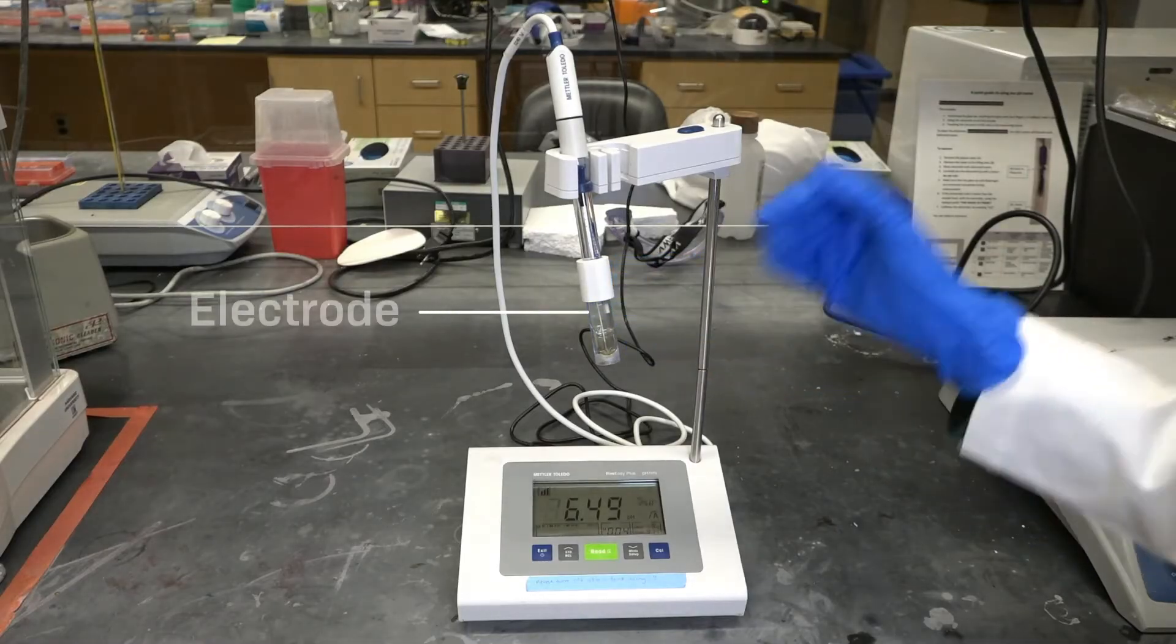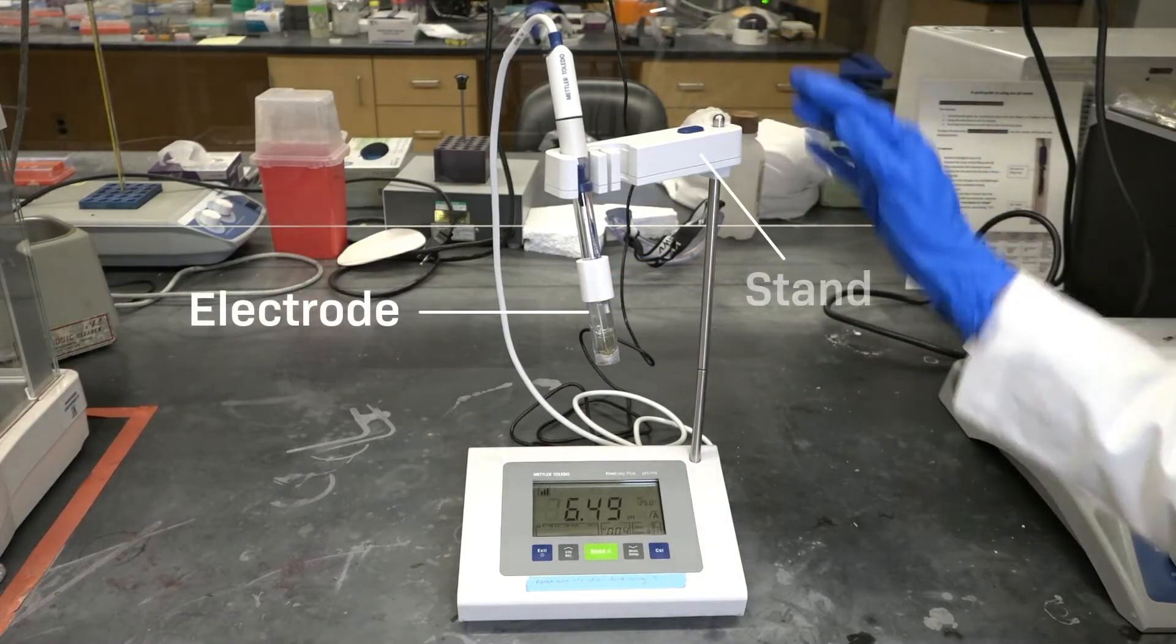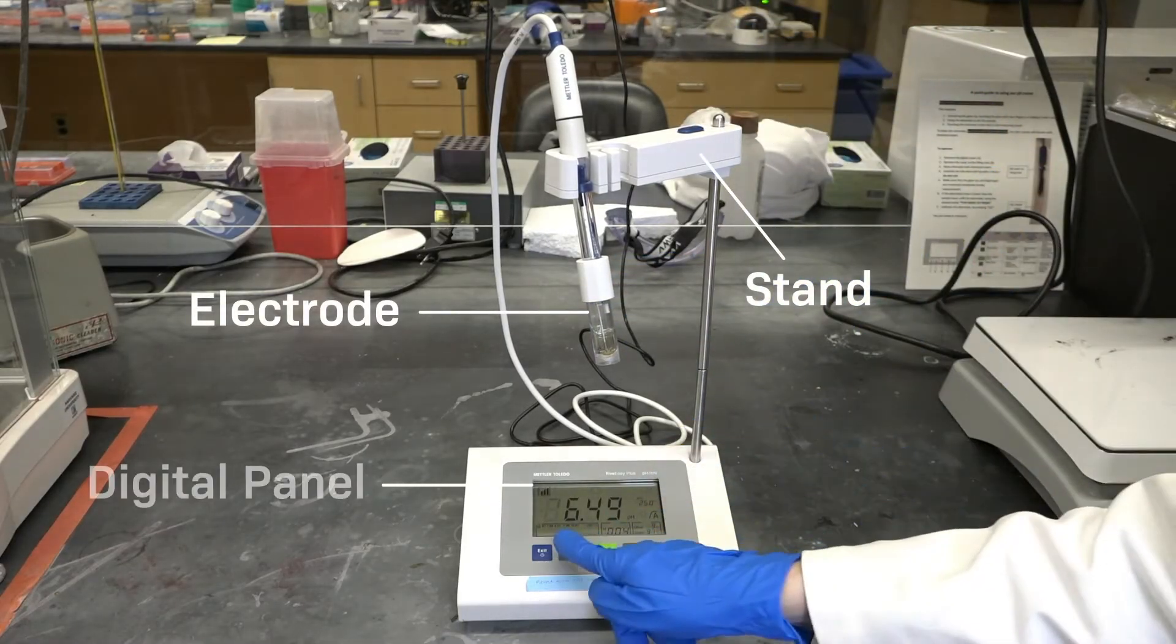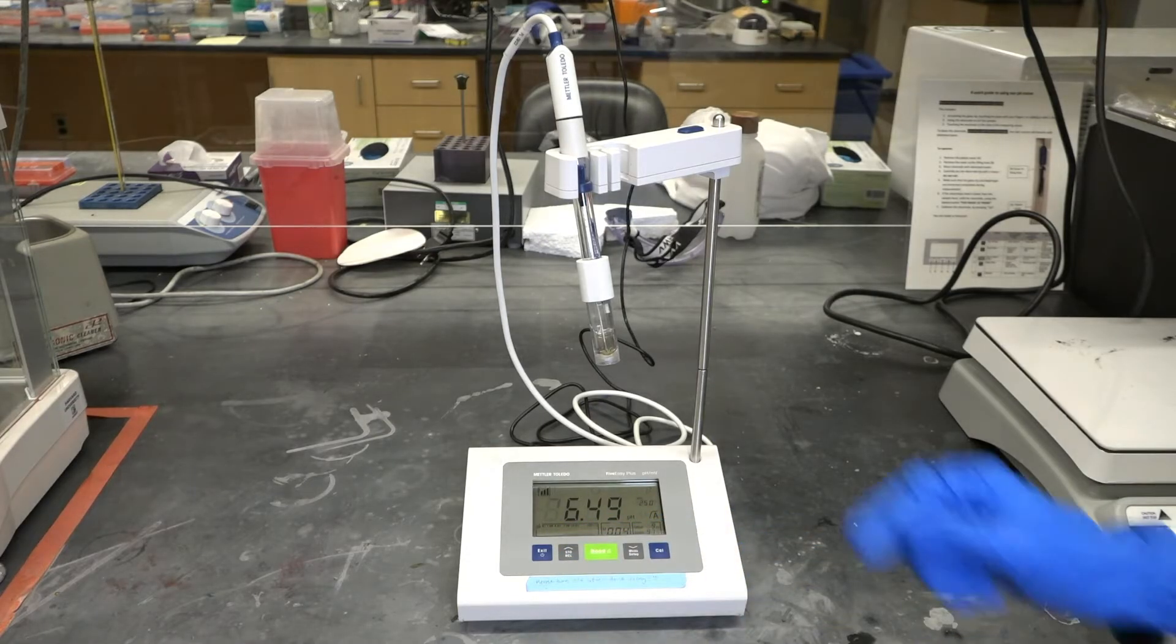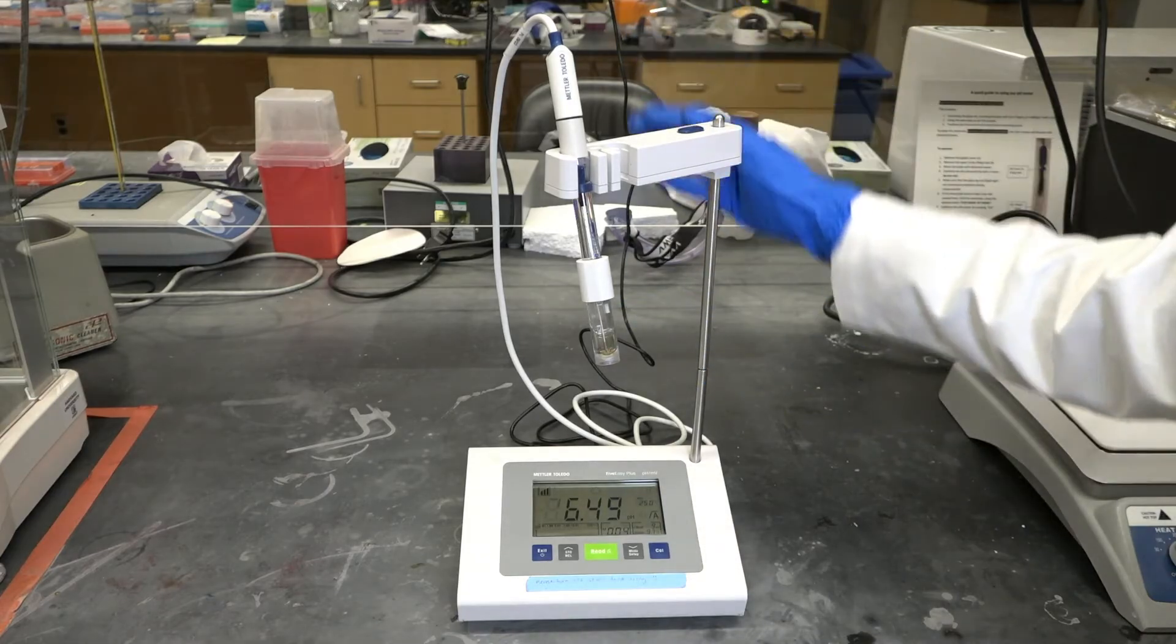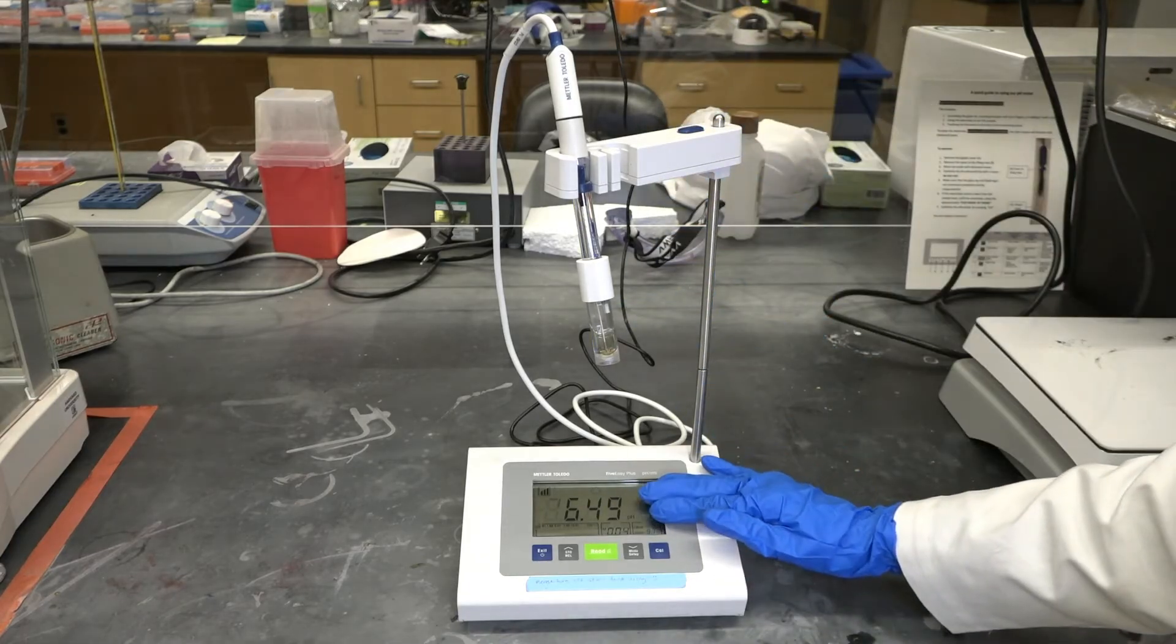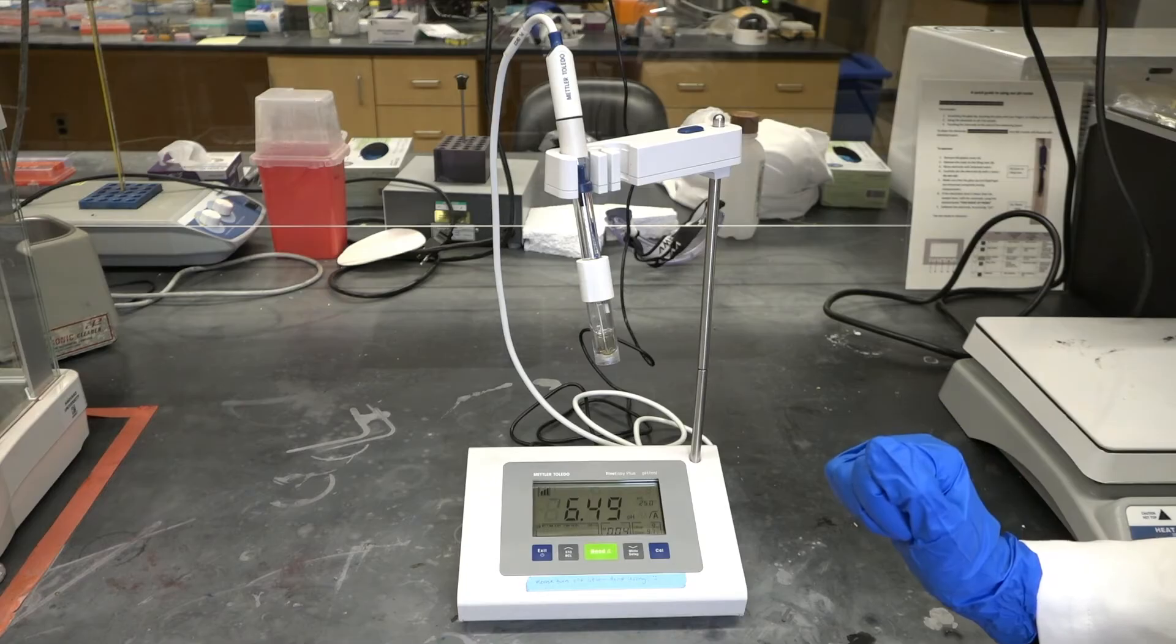The instrument we use to measure pH in the lab is fittingly called a pH meter. It consists of an electrode, a stand to hold up the electrode, and a digital panel for controlling the instrument and displaying measurements. The electrode will measure the electrical activity of the hydrogen ions in a solution, and the panel will translate that to a pH value ranging from 0 to 14.